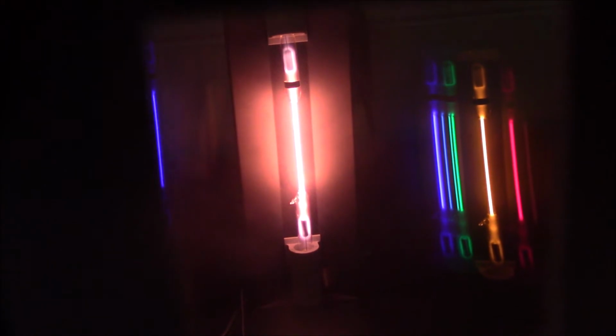And what you notice is, off to the side you see a bunch of lines. So there's a red, there's an orange, there's a couple greenish and a violet. And each of those lines is caused by specific energy transitions. Now, when they all come together, hit our eye, and signals go back to our brain, we kind of do an averaging.